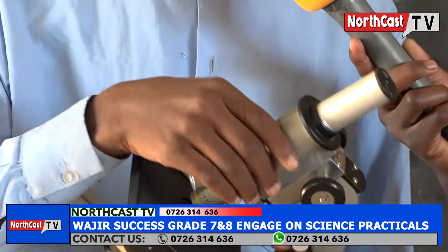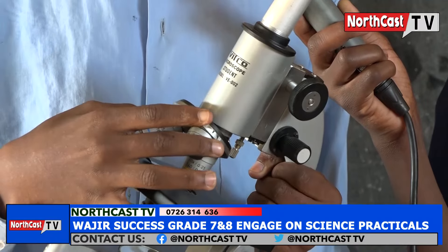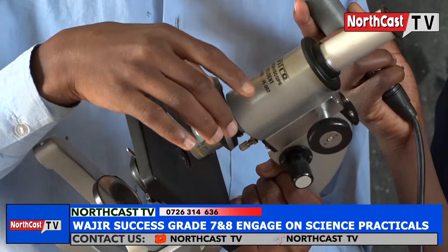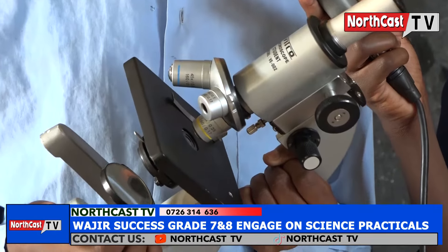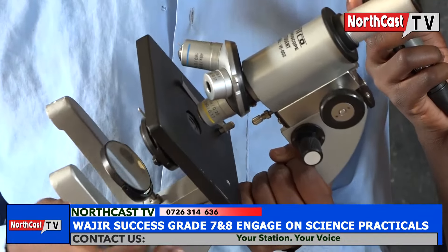The other one is the body tube. This is the body tube. The body tube holds the revolving nosepiece and the objective lens in place. The other one is the revolving nosepiece. The revolving nosepiece holds the objective lens in place.